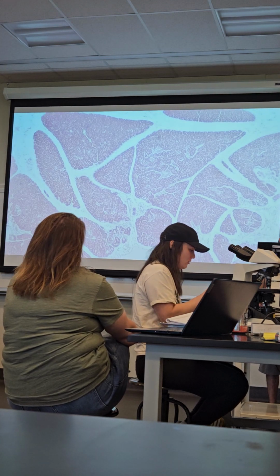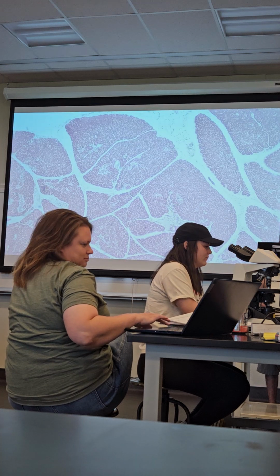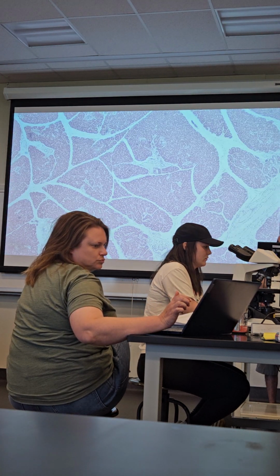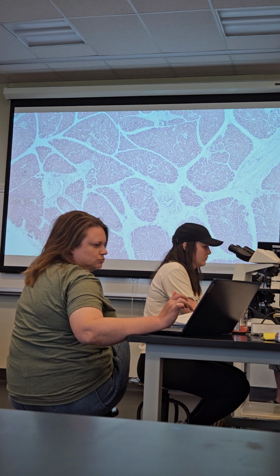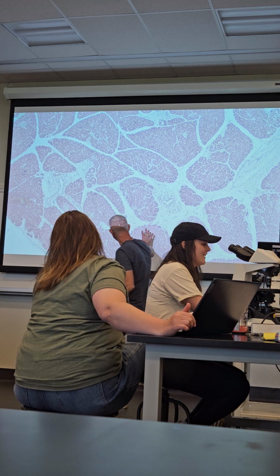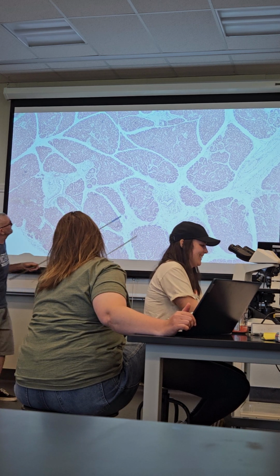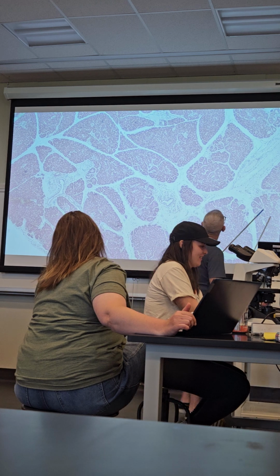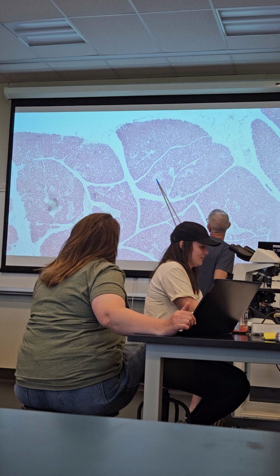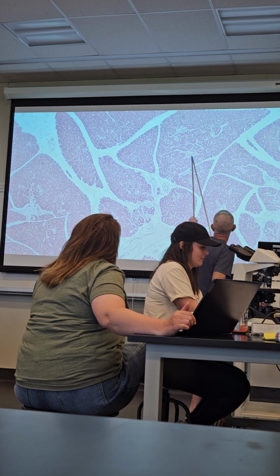What's the organ that's all sorts of segments? Pancreas. Yep. It's septated. What's that? Pancreatic duct, carrying pancreatic enzymes from pancreatic acinar cells to the duodenum. And then our islet, we already had an example of that. There's an islet. Pancreatic islet, which has insulin.